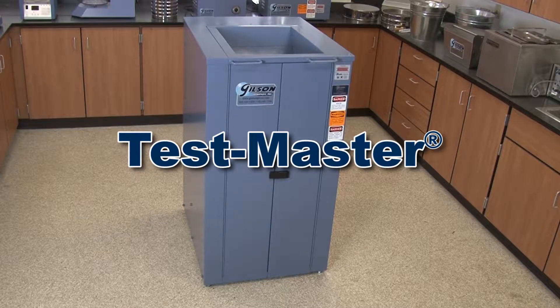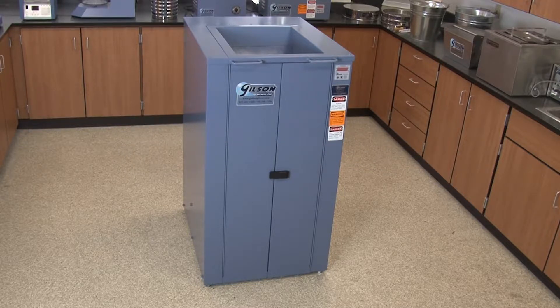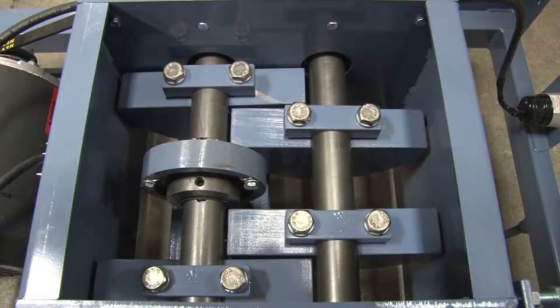The Gilson TestMaster also delivers accurate particle size determinations of large samples, but includes an easily controlled integrated hopper and an internal rotating counterweight drive system for smooth, quiet operation.